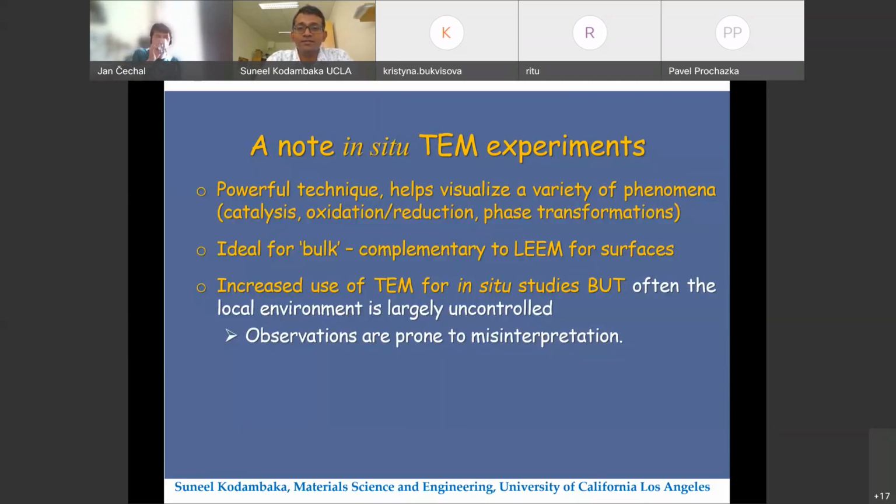And this is an unintentional consequence of using focused ion beam milling. And you may have other elements diffuse as well. So when you use platinum to glue the FIB-made sample to the grid, you can have platinum diffuse through the grid onto the sample, which we also observed. And these are undesirable if your real goal is to just focus on the sample of interest. And so identifying the right approach for making the sample is key.